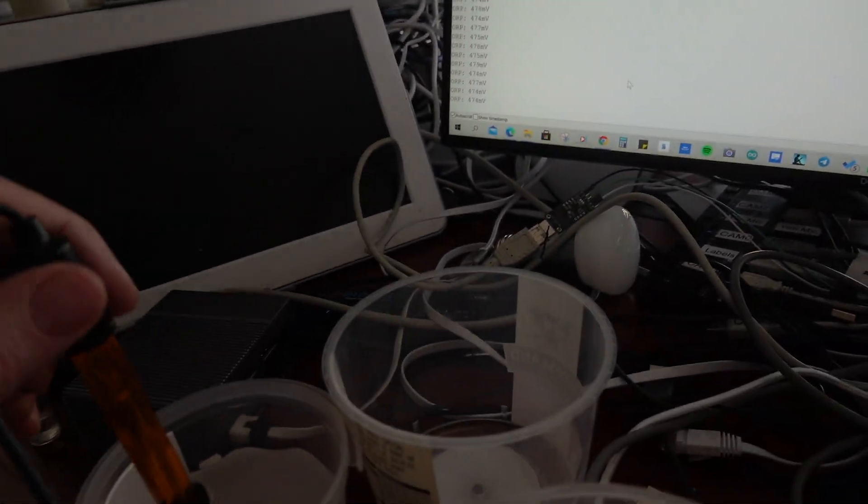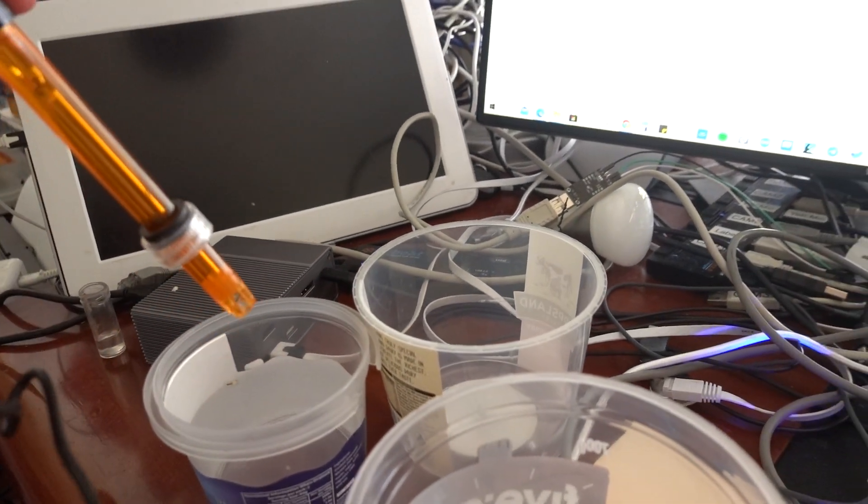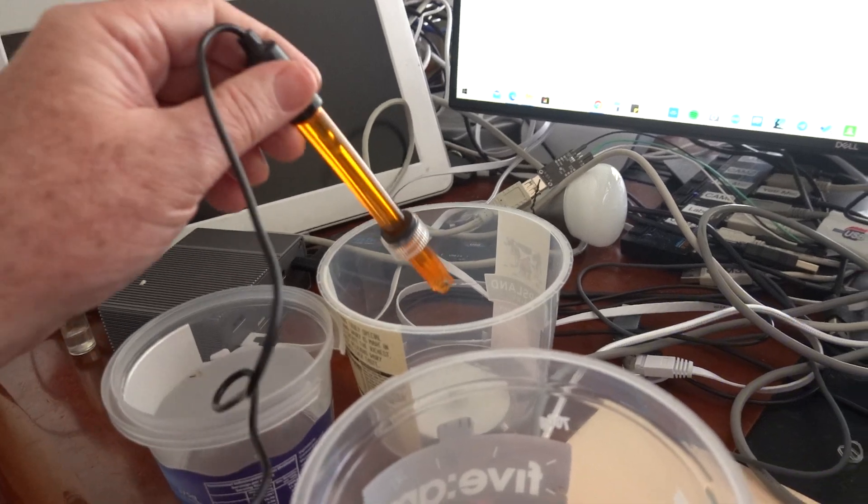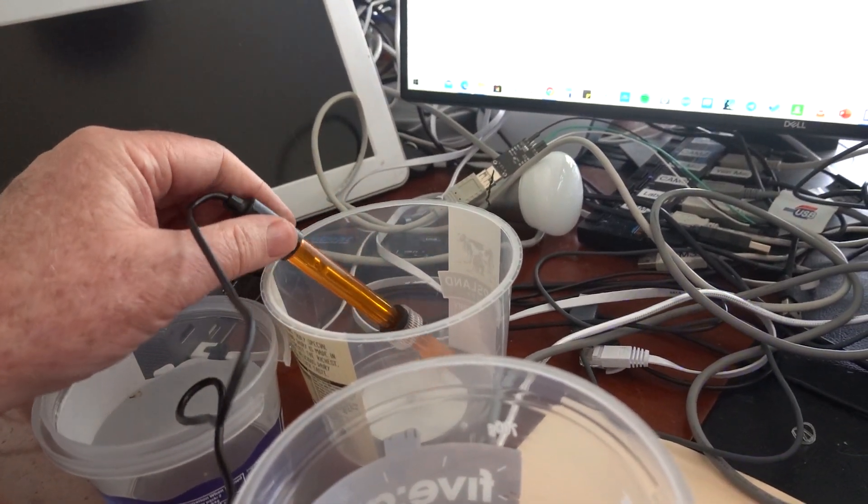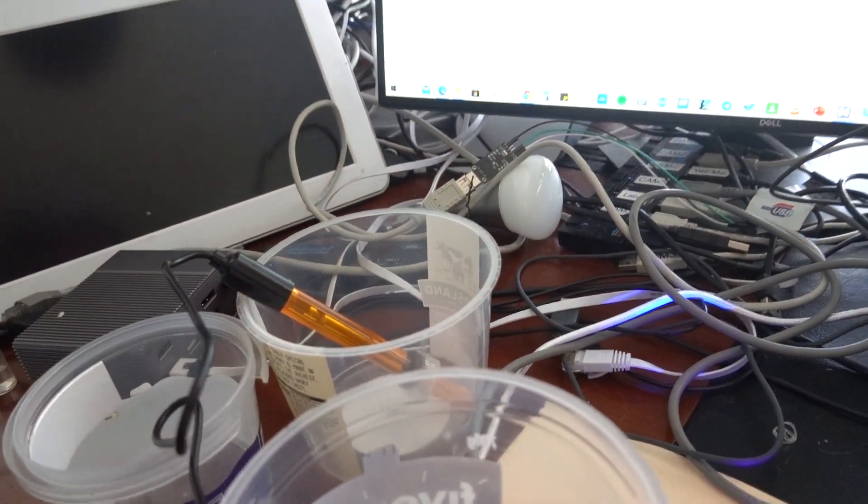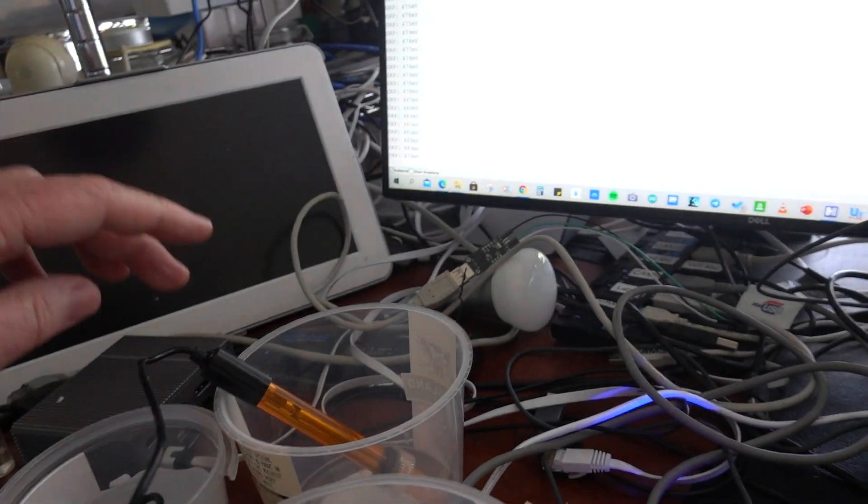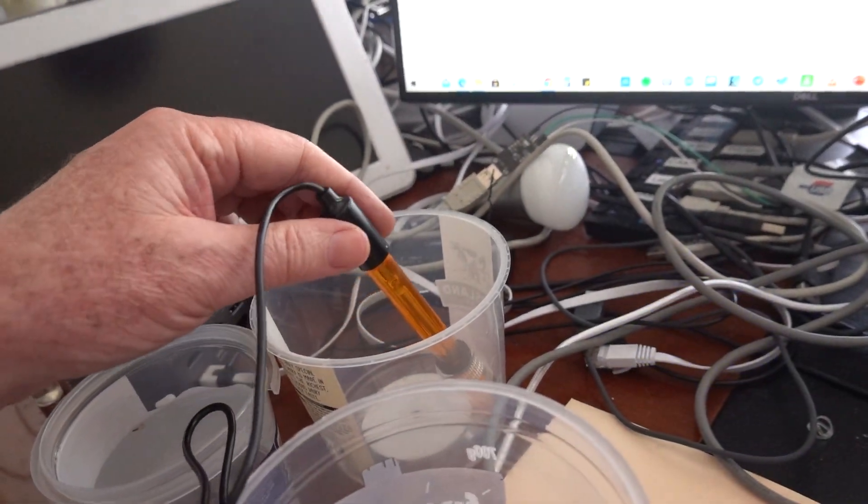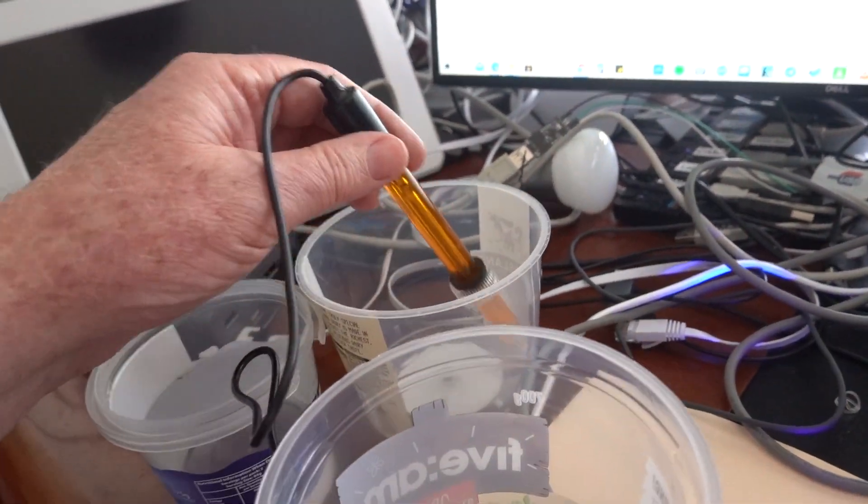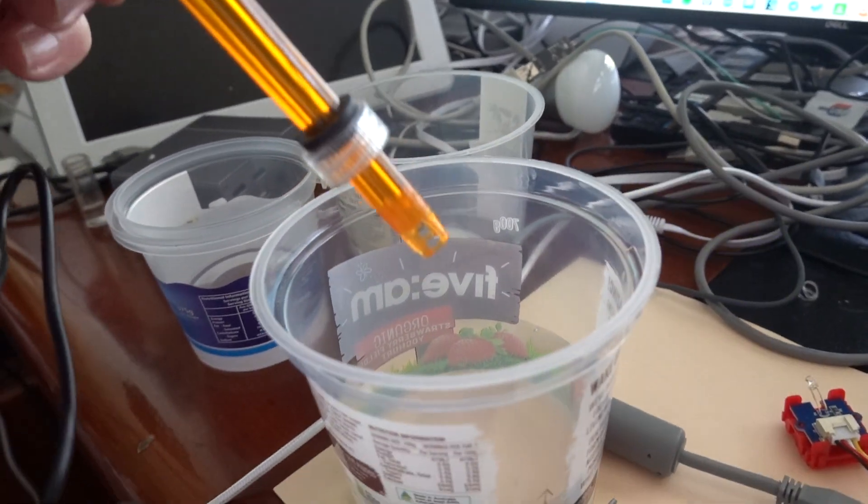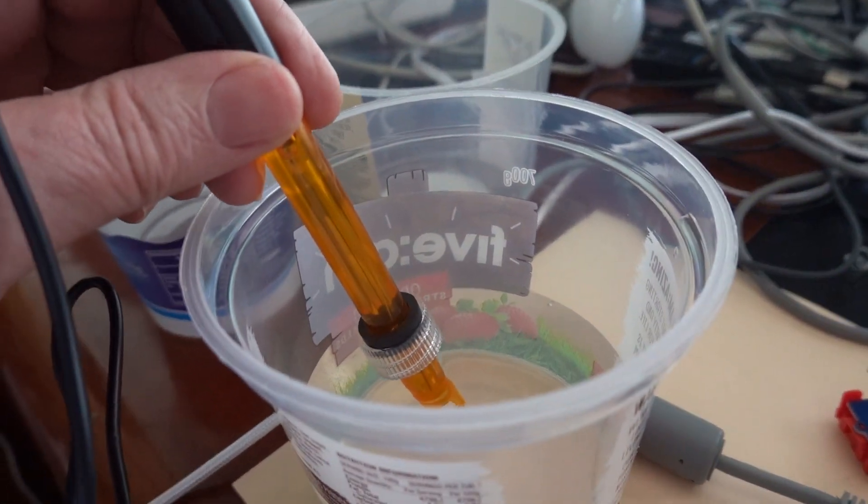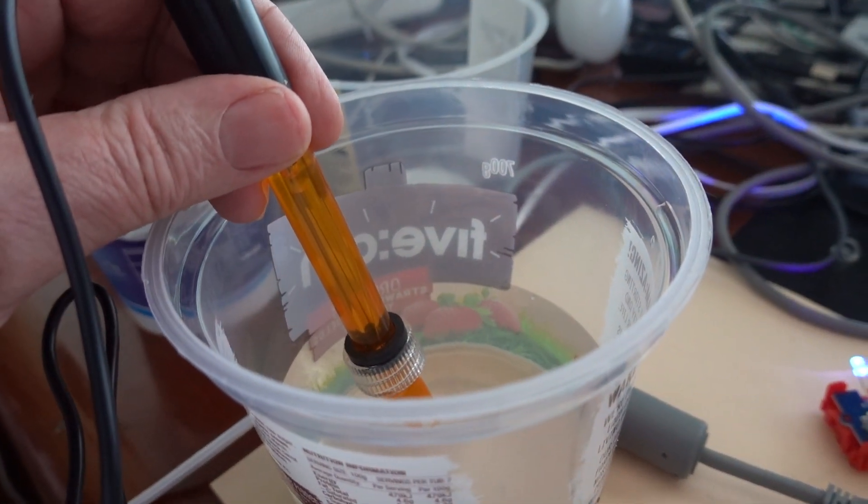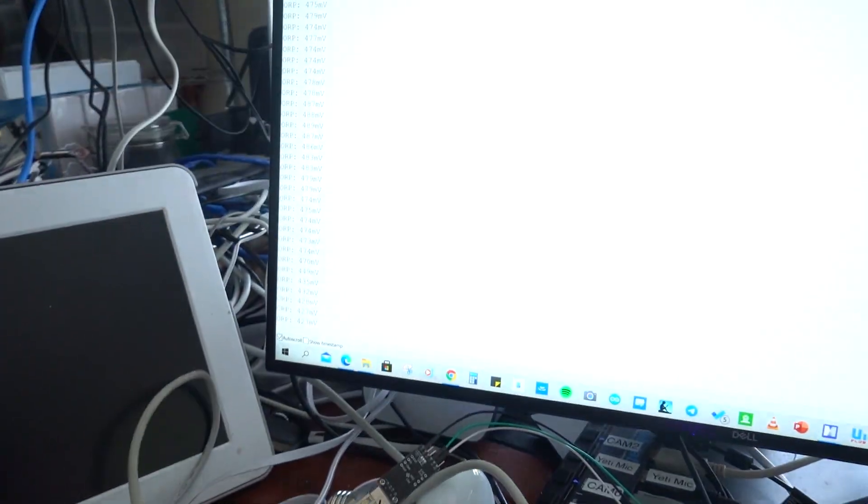Now if we take it out, let it dry for a little bit to minimize contamination, what we're now going to do is put it into tap water. So we take it out of here and we put it into tap water, and we go back and have a look at the values.